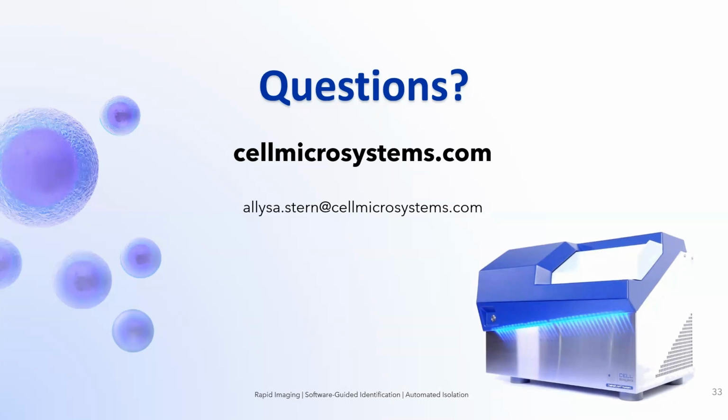We can Z-stack them. Of course, without confocal imaging, you get a little bit of variability once you get high up in your Z-stacks. But 100% you can grow native organoids and then do some sort of immunolabeling to identify, so to speak, organoids of interest based on that fluorescence inclusion.